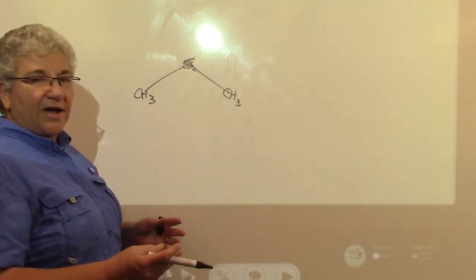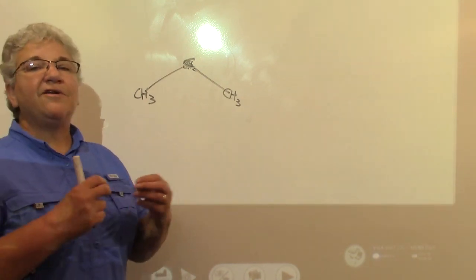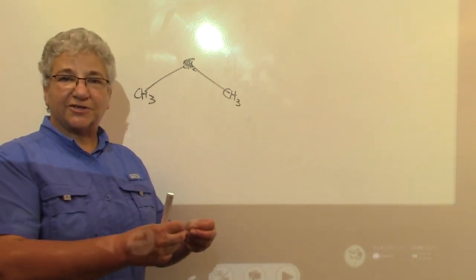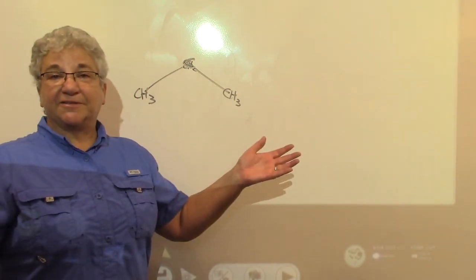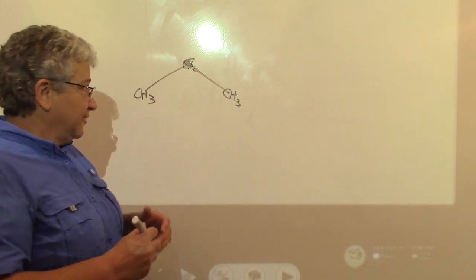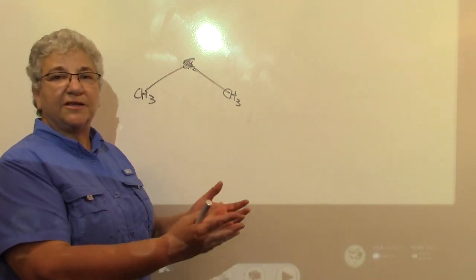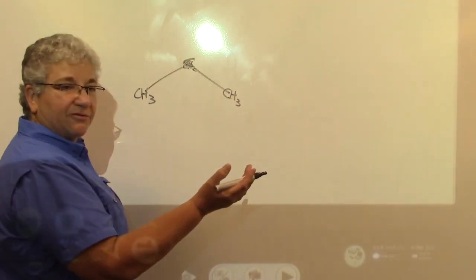And so now the question becomes, let me just be clear for a minute. We are not simply looking at whether our carbon atoms are CH3 or CH2 or CH or C, because that only gives us 4 choices, and we have many more peaks than that in our spectrum many times. So don't think you're just looking at CH3 and CH2, but you are looking for which atoms are different in your molecule. And so CH2 is clearly different from a CH3.